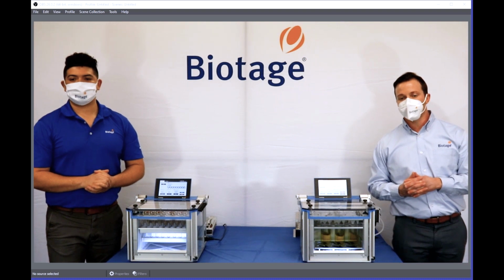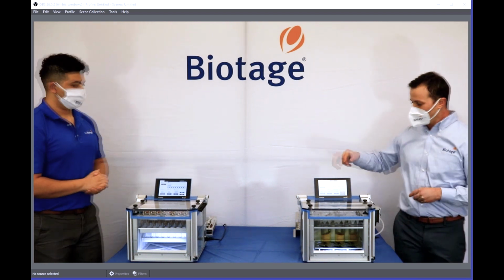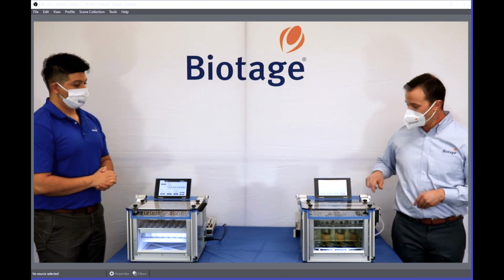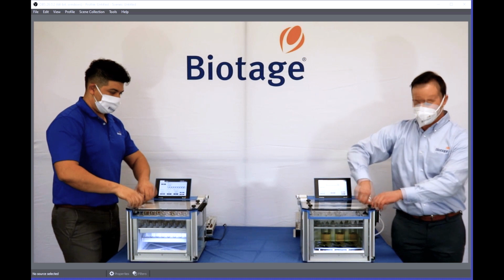Leanne wants to ask if we can demonstrate a manifold exchange. Yeah, we could. Do you want to take out yours? Sure. We have a few minutes here. I'm up for the challenge.